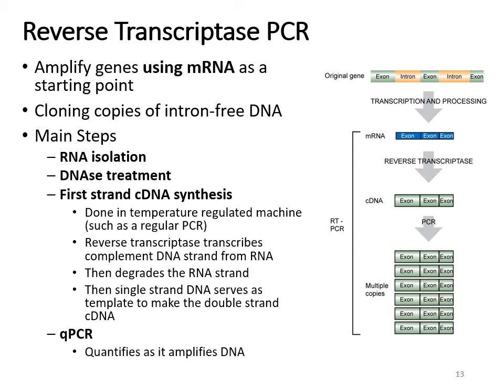Okay, because PCR only works for DNA. PCR can only amplify DNA. So if you want to study RNA with PCR, you first have to make a DNA copy. So that's why you need reverse transcriptase PCR. Okay, keep that in mind, circle, write down that note, put little stars next to it. PCR only amplifies DNA. Okay?